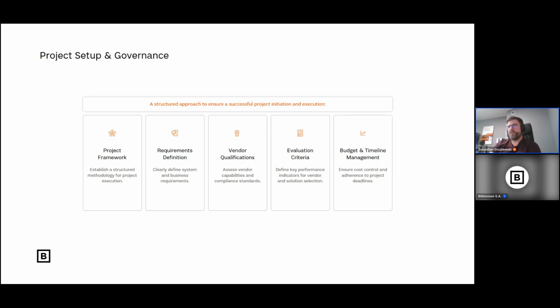But we had a great software vendor that delivered software in a really great state that had, let's say, a really small number of bugs, but when we submitted something, we just waited over a year and nothing happened. And sometimes this is a critical thing that is hindering the work of your laboratory.